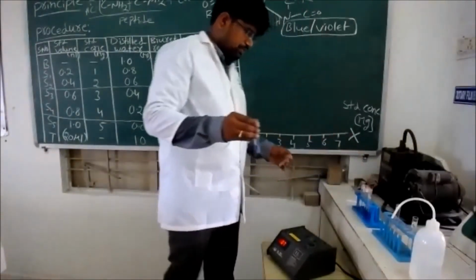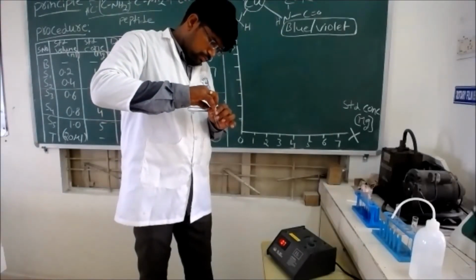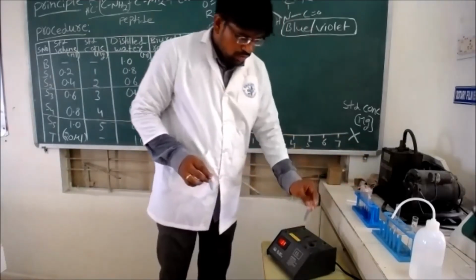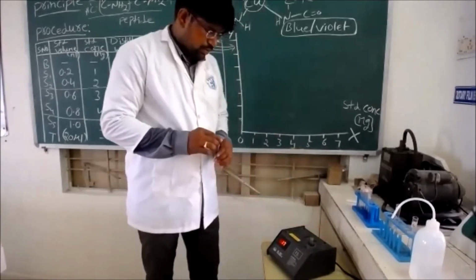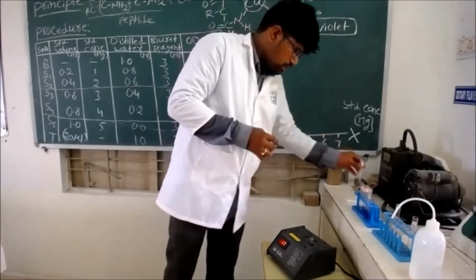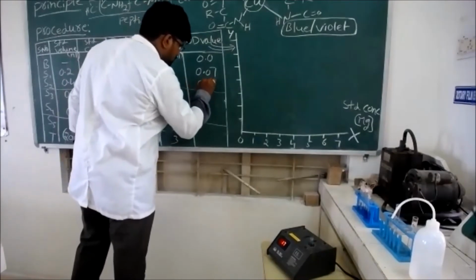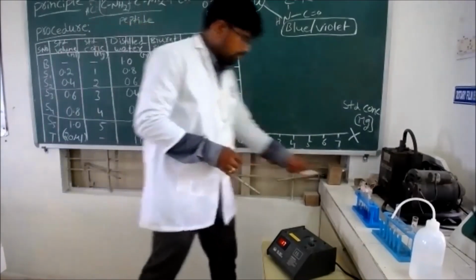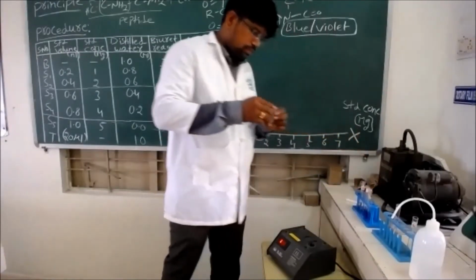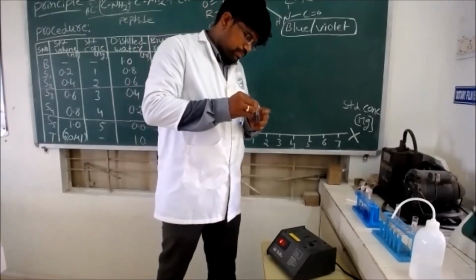Next S2. So this is S2. The value with S2 is 0.17. Then prepare the S3.